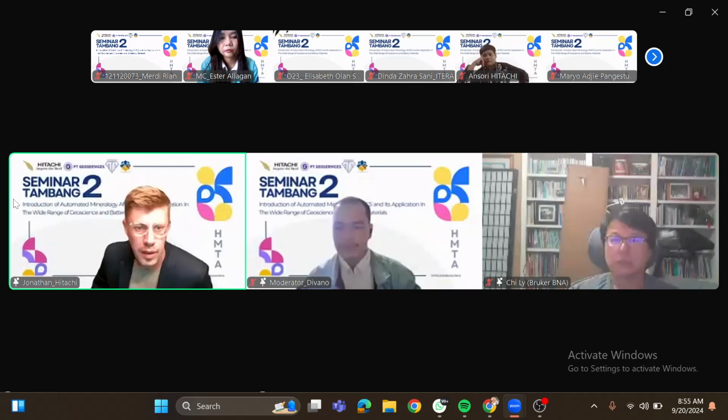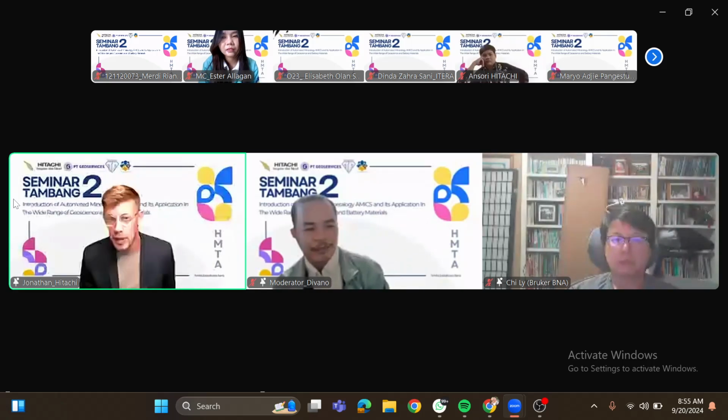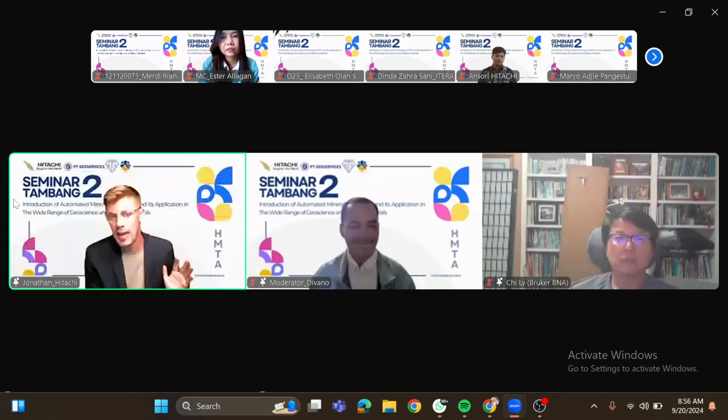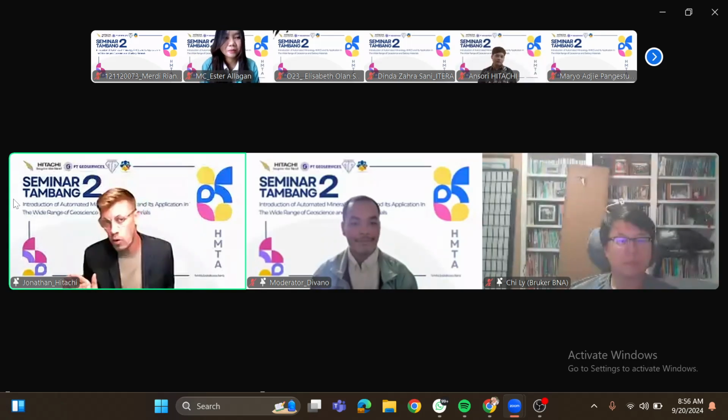Okay, so to be clear, AMICS is a data collection tool. So it is not making predictions. We have other software that's used to help make predictions and other tools to help make predictions using machine learning. And what I have learned from doing a bit of machine learning, I'm not a super big expert, right? But I'm starting to learn more, is that for every system, the sensitive variables are going to be different, right? And it depends on the data you're collecting. But what is very, very important is the consistency of collecting that data.